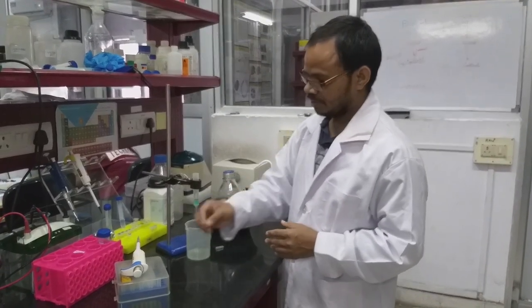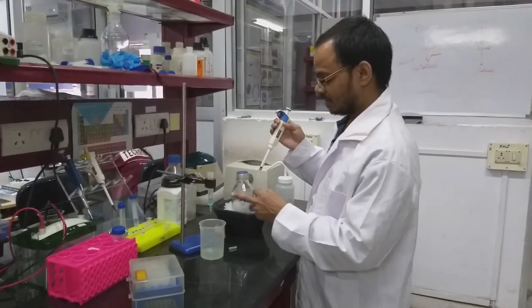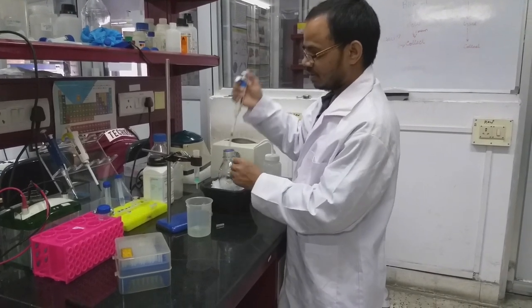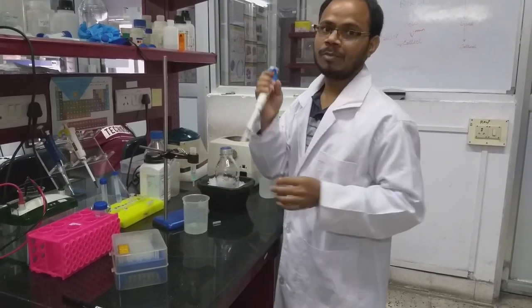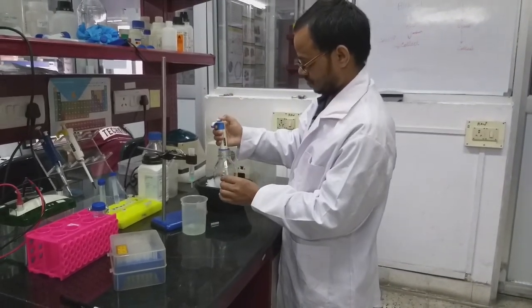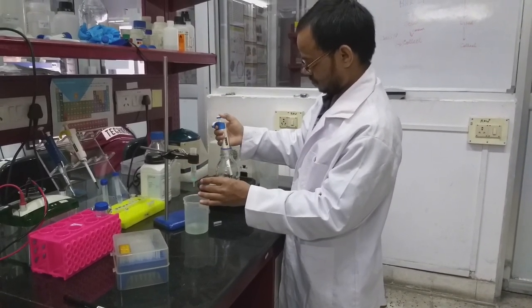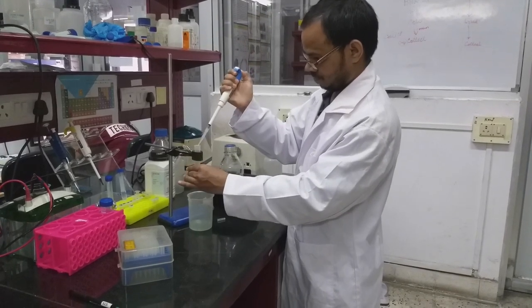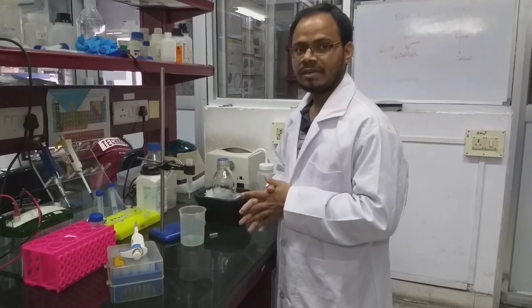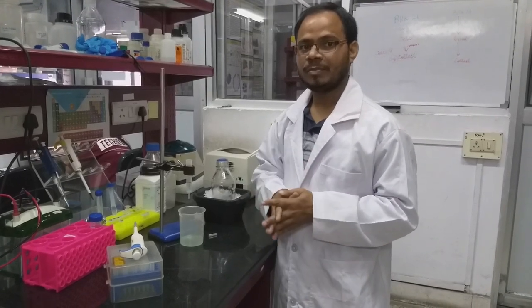So after 20 minutes we eluted the nickel solution. Next we will equilibrate with the lysis buffer. We have to wash at least 2 column volumes to remove any free nickel which exists in the beads. So after equilibration, next step we will load the lysate and then incubate for binding.